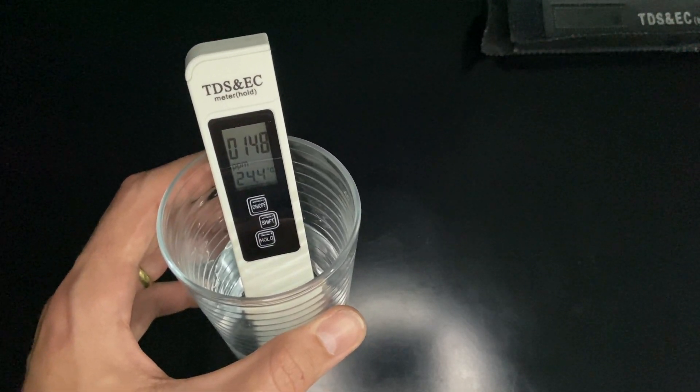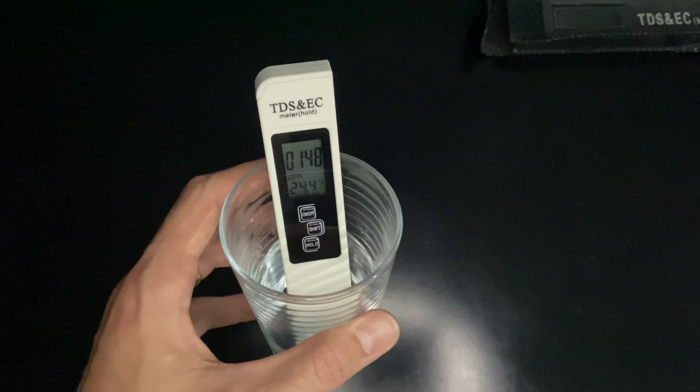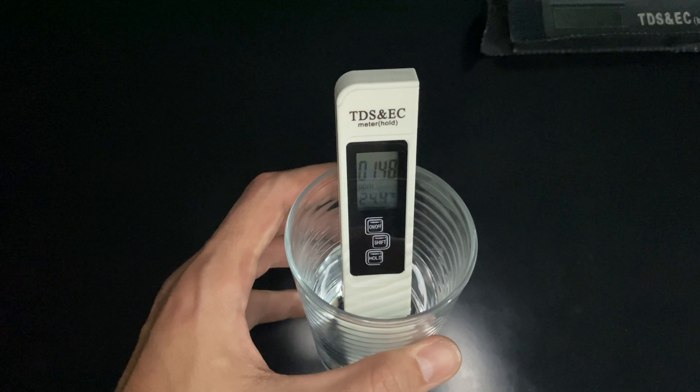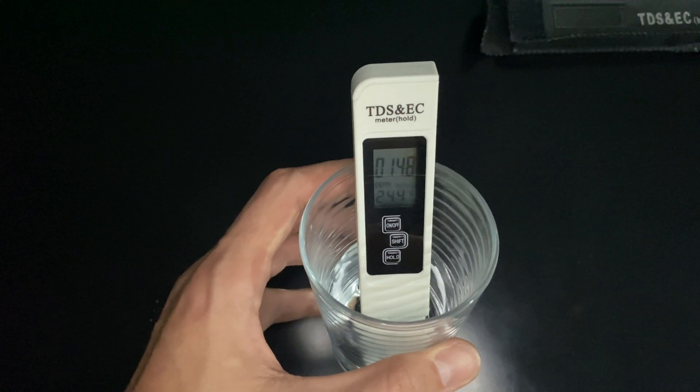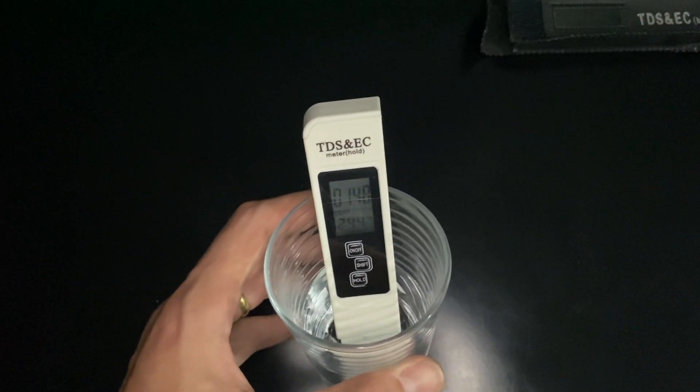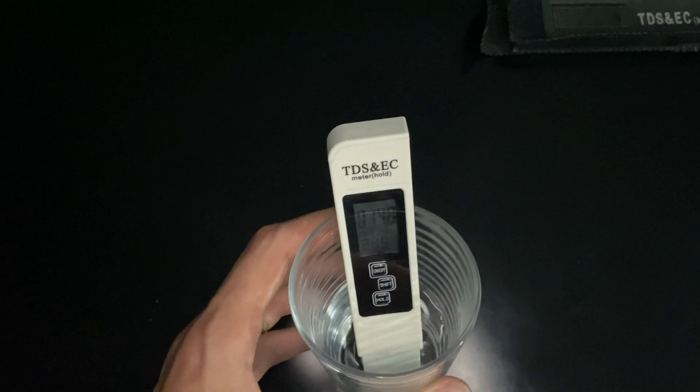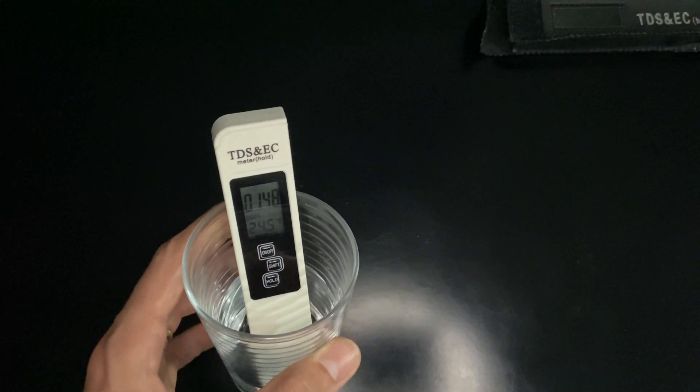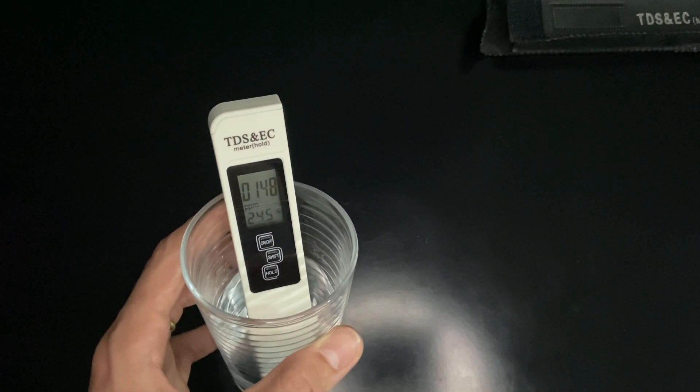From 0 to 300, it's excellent quality. 300 to 600 is good quality. 600 to 900 is acceptable quality. 900 to 1200 is bad quality, and above 1200 is unacceptable. As we can see, the water filtration system is working because it's excellent water to drink.